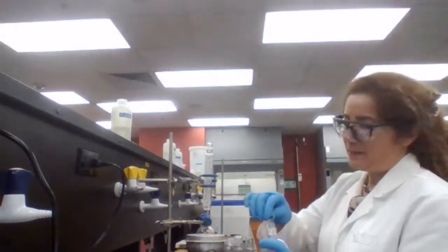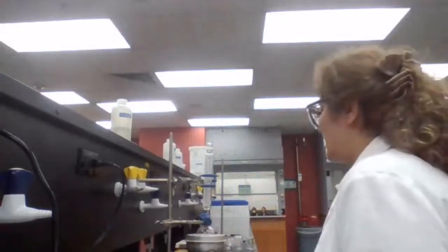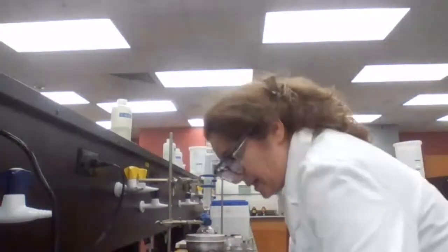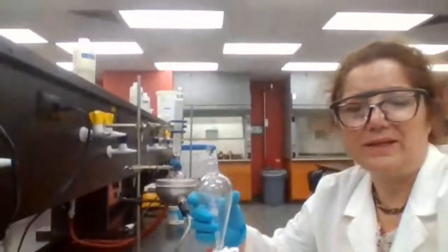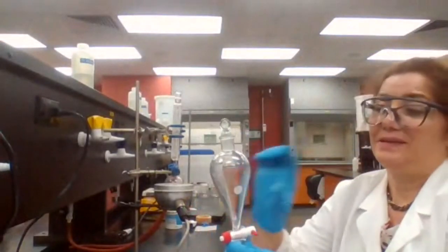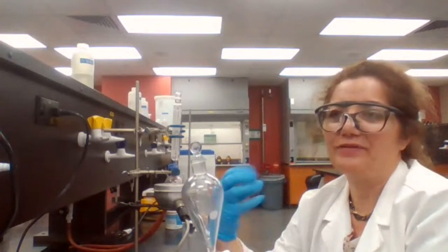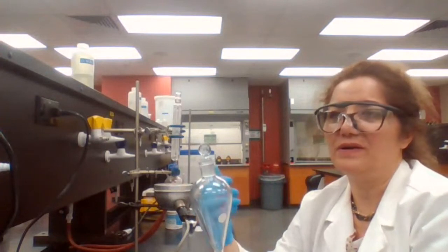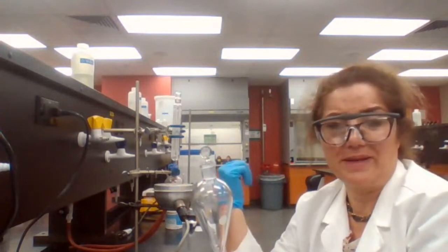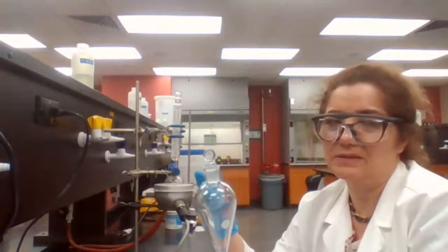When you are using extraction, basically you have to set up the extraction, and you are using a separatory funnel. In extraction, you have two layers. One is an organic layer, and the other one is an aqueous layer. Which is the organic or aqueous layer is determined by the density of the two layers. So you are going to have two immiscible layers, and you have to choose your solvent properly. The extracting solvent should dissolve your compound of interest. So in this case, the methyl benzoate should be dissolved in the solvent that you are choosing, which is the ether.